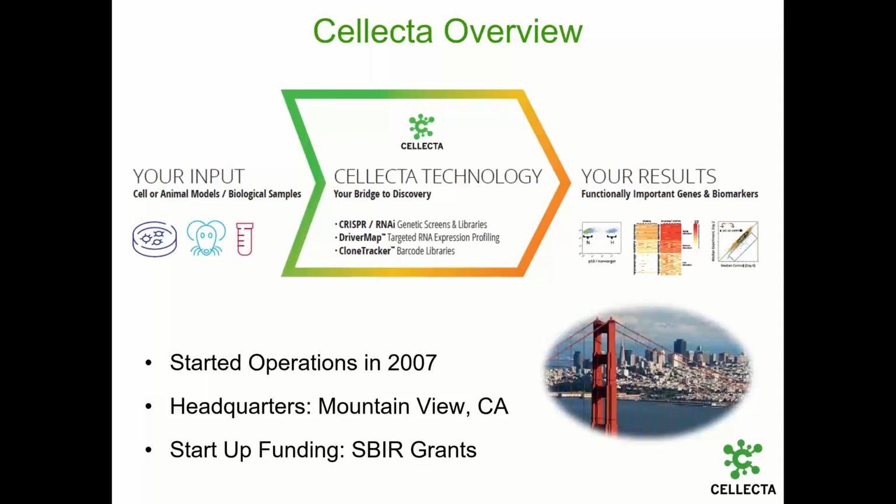In particular, the goal was to create technology platforms that enable broadly parallel simultaneous analysis of large numbers of genes at once, a genome-wide analysis approach, but that use technology that does not require large-scale automation, LIMS systems, or industrial infrastructure that only a few labs have, large pharmaceutical labs and biotech labs mostly. Our aim is to provide tools that can be used by a wide range of more traditional laboratories, basic research labs that are familiar with standard molecular and cellular biology techniques.